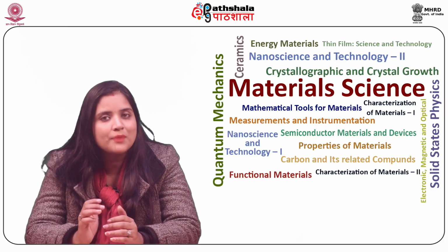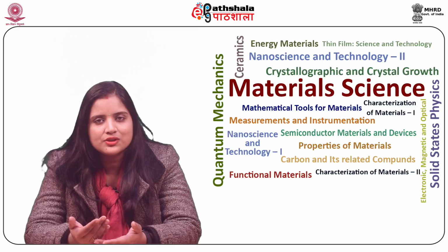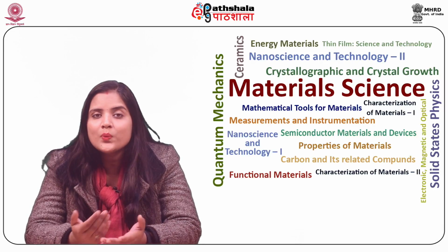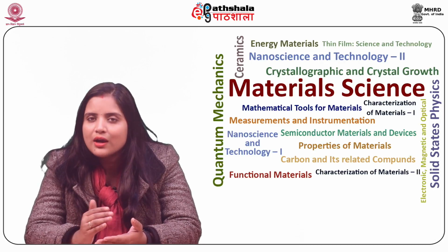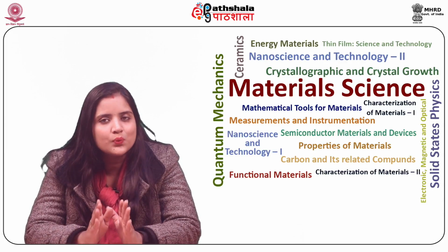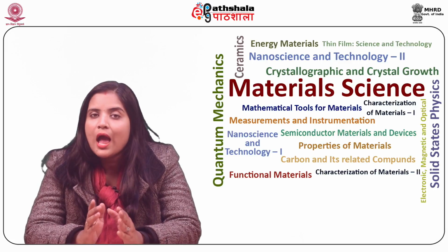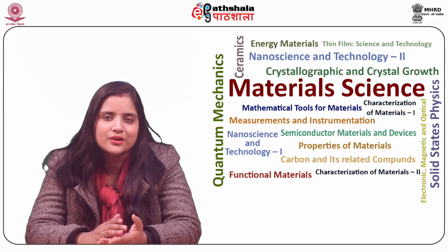A wavelength dispersive spectrometer comprises a crystal monochromator and an X-ray detector, which is often a gas proportional counter. The arrangement is made in a way that incoming X-rays are deflected as per Bragg's conditions, and some of them are recorded by the detector.